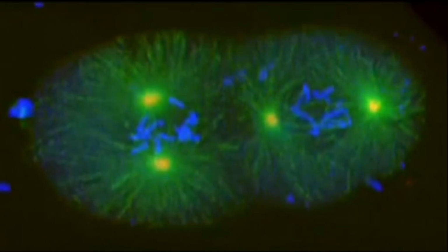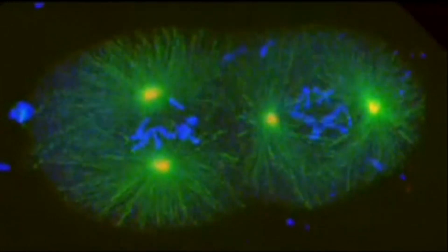This is a very steep climb, especially since confocal microscopy is not the center of your work. It's just a side tool that you are using to get your data after you have already done quite a lot of things before that. It differs a lot with Cytely.